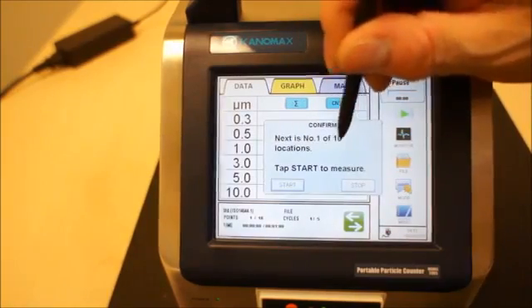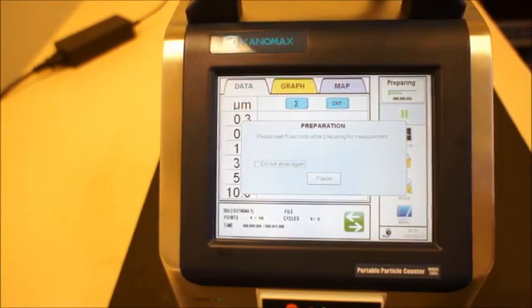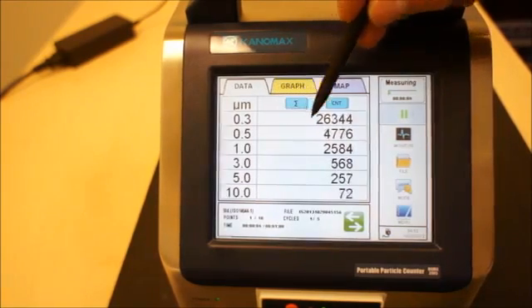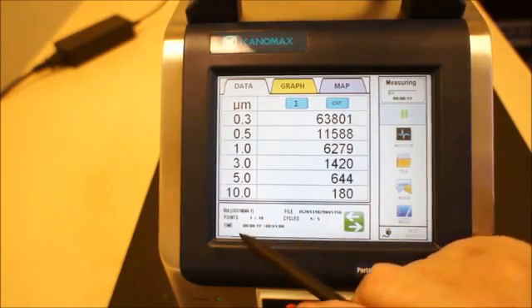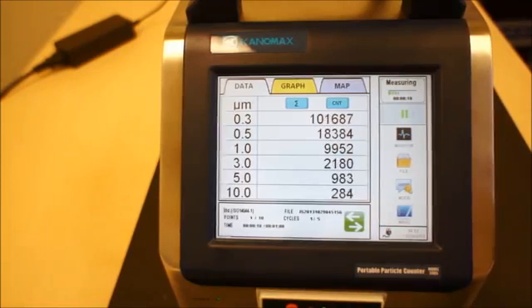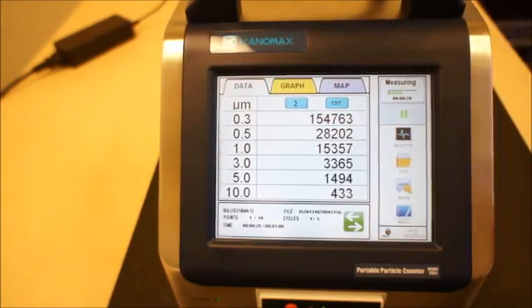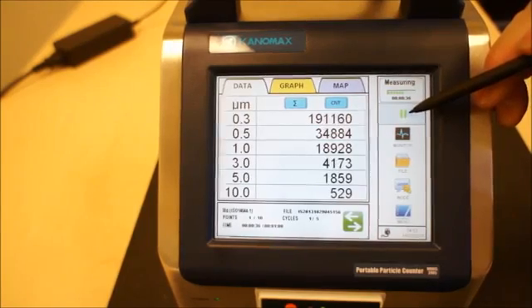We're starting now at number one of ten. It pauses for ten seconds, allowing you to step away from the instrument while it's being operated. You can see the counts as it goes through its measurement cycle. It notes the standard you're in, what point it's at, and the duration of each cycle. Here's the measurement time — it will tell you how much time is left in that cycle — and you have the ability to pause the instrument if needed.